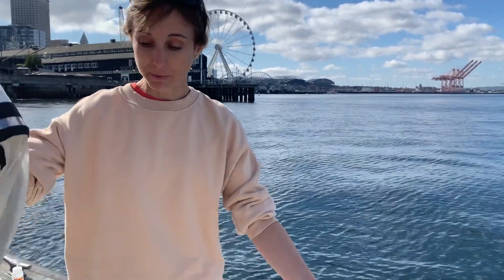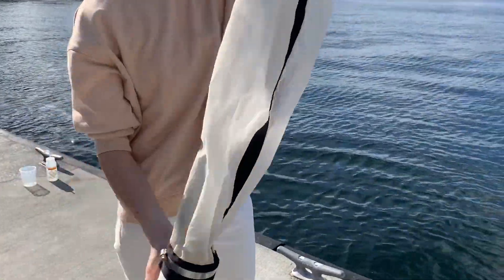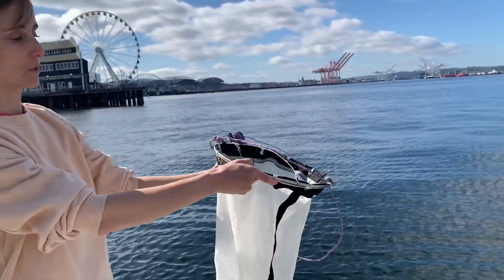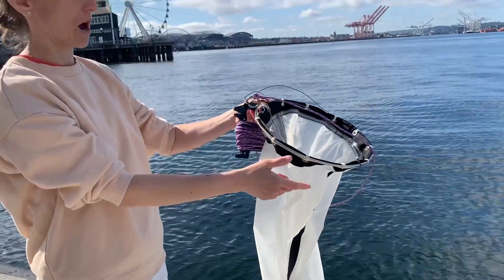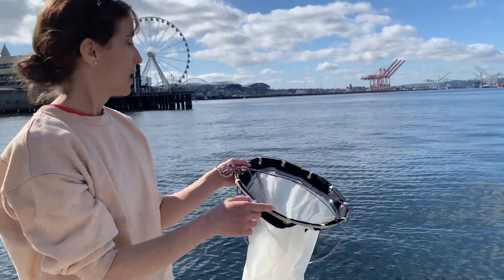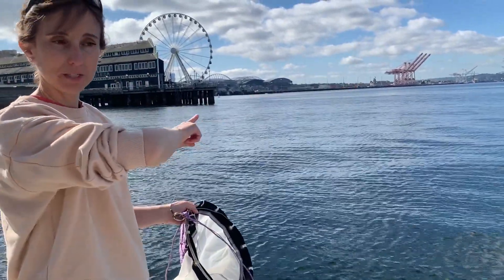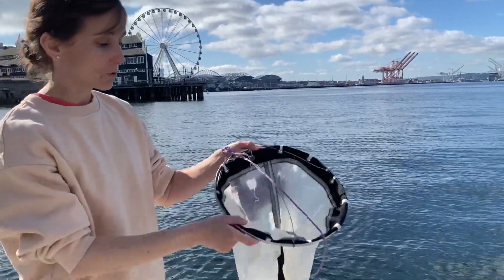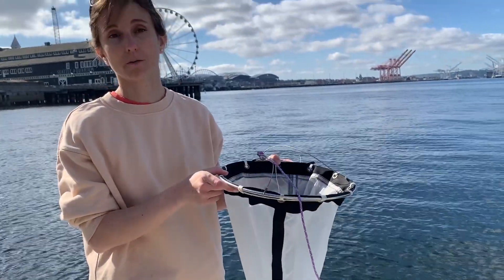Okay, these nets can be deployed in a couple of ways. What we're going to do is just send this net vertically down into the water and then pull it straight back up. As we pull it up it's going to filter through the seawater and we'll collect all the plankton in that column. We could also do a horizontal tow — I could just throw this in the water and walk back and forth down the dock if I just wanted to collect something right at the surface. We could also tow this behind a kayak, or throw it off the back of a ship and tow it from a ship.